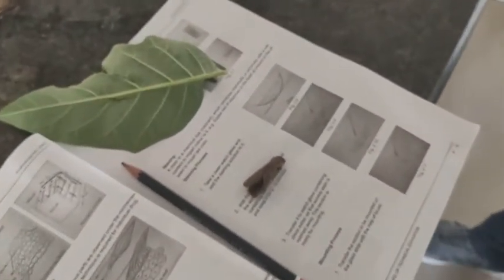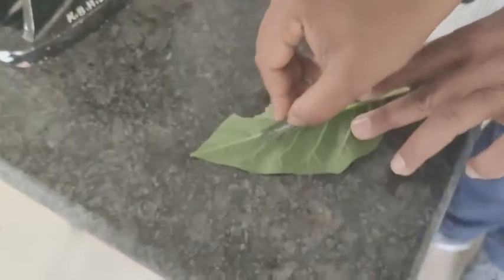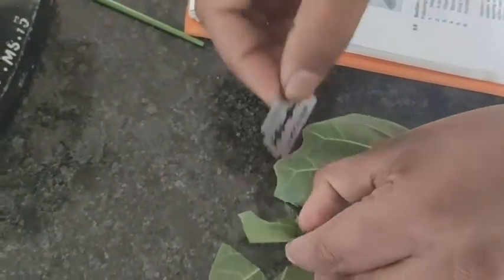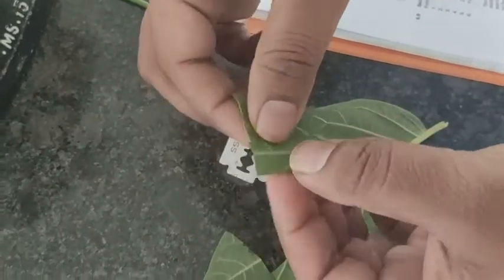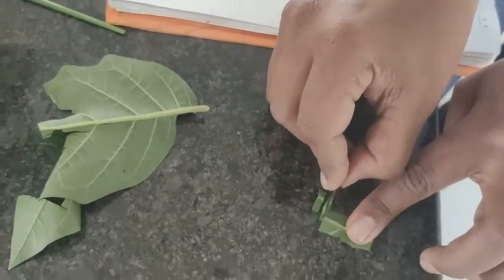If you have to use bark, and if you have to use leaf, there are different types of techniques you have to use. This leaf you can easily cut with the help of your sharp razor. In this way you can easily cut, yes or no? Then you have to take the section of the leaf. This you can easily cut. Why can you easily cut it? Because it is very soft.